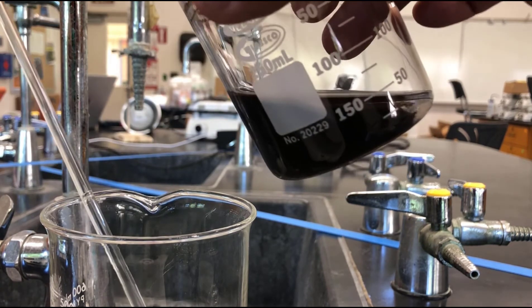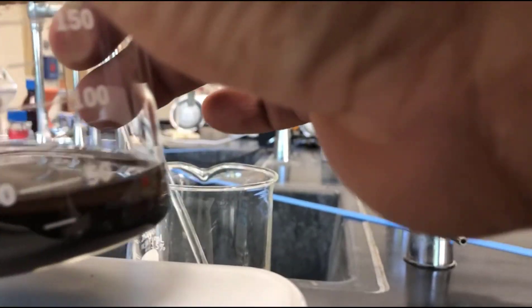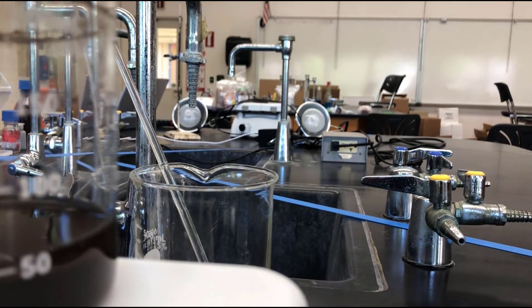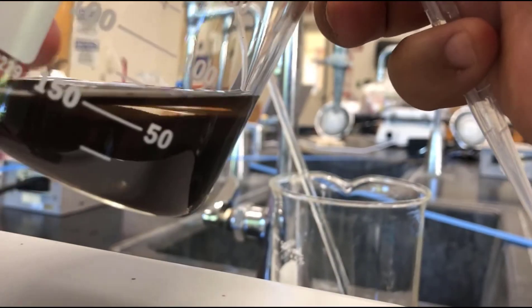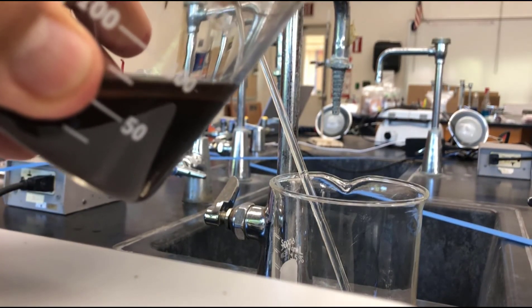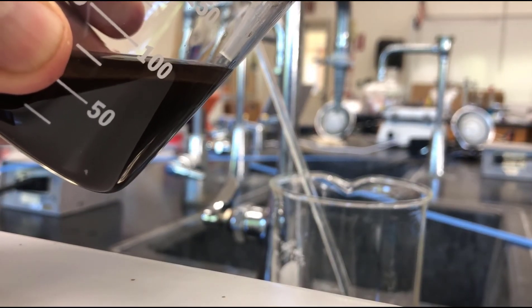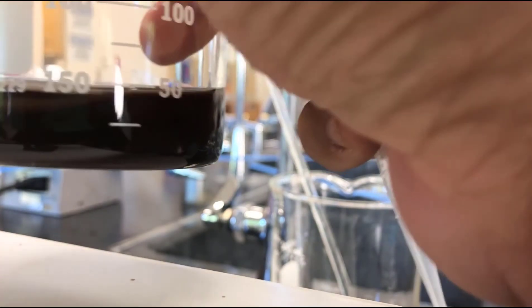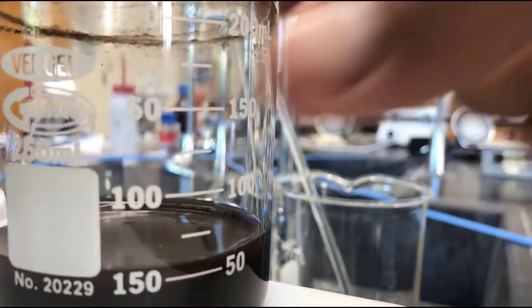I feel like I'm going to lose a little bit too much here, so what I'm going to do is use a pipette to take a little bit more liquid off. Just go like this. I don't think there's enough to get rid of, so we'll just leave it. But you can use a pipette sometimes to get that top layer off.